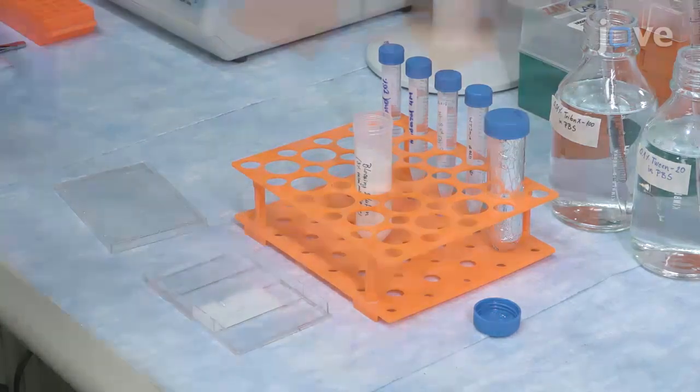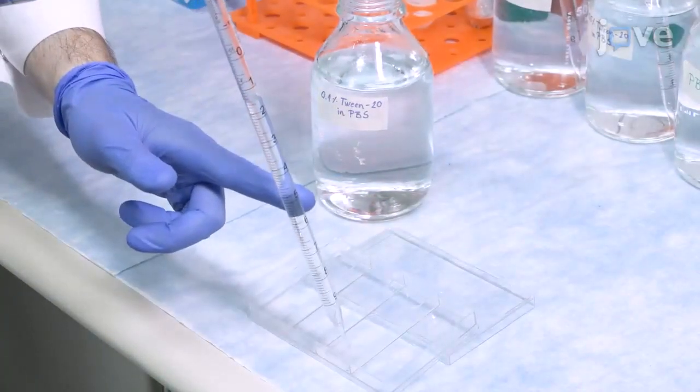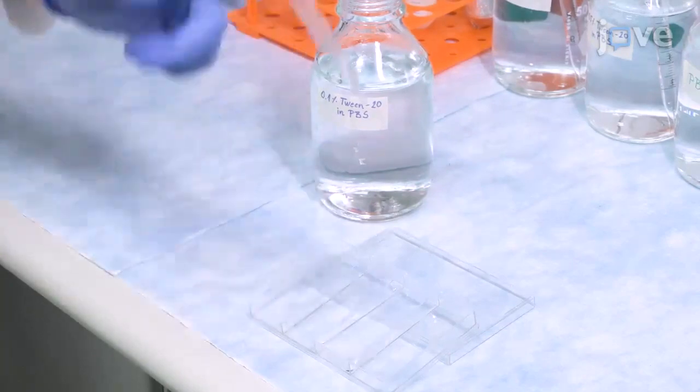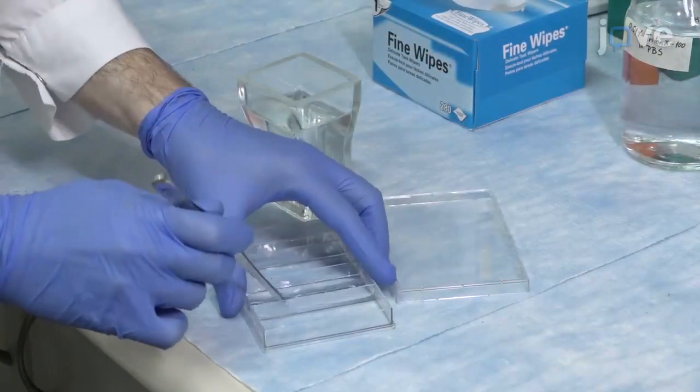This video will cover how microarray technology can help redefine primase sequence recognition sites, and how a high-throughput approach can complement classic biochemistry.